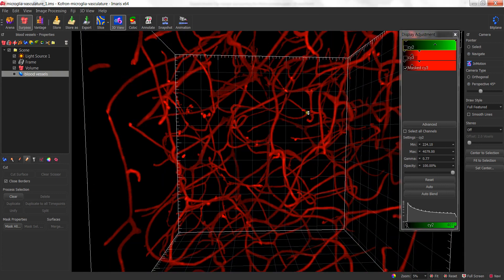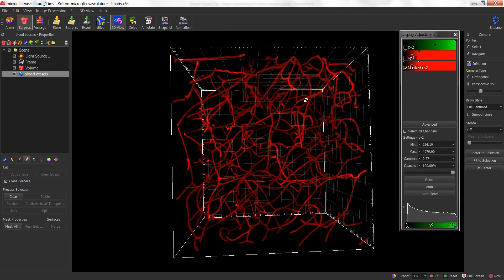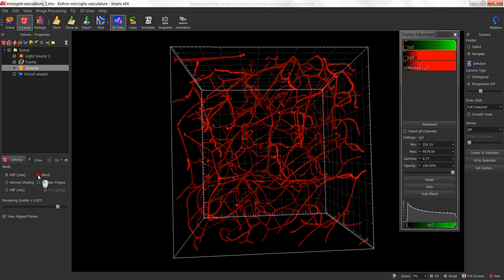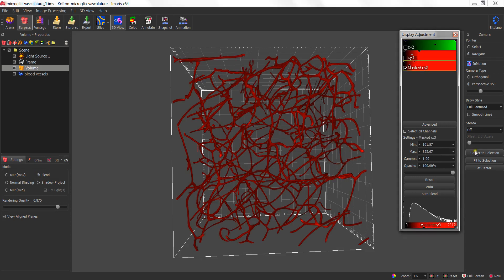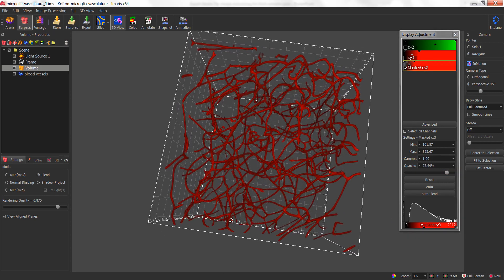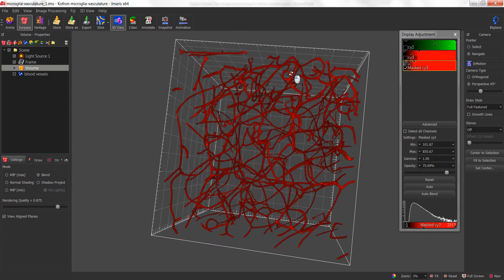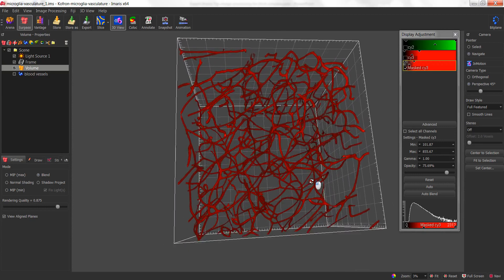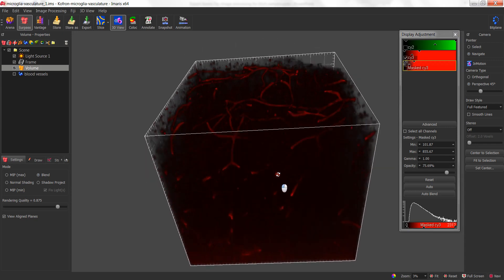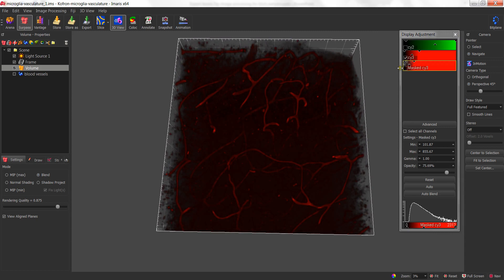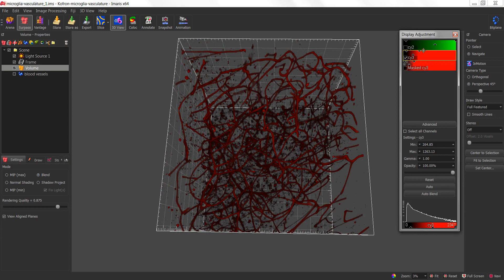One other thing I wanted to point out: whenever you apply a mask function and get rid of some of the background information, the other visualization techniques available in Amaris are also now accessible. In this case, I'm going to switch into the blend technique, which allows us to include shading and opacity, and I'm also going to adjust some display settings to visualize that 3D data. So now we have a 3D reconstruction with both an attenuation correction and a surface mask to make it easier to see those structures of interest. If I compare that to the original dataset — the data with background but attenuation corrected — it's a little more difficult to get a similar result using the blend technique because there is so much more background.